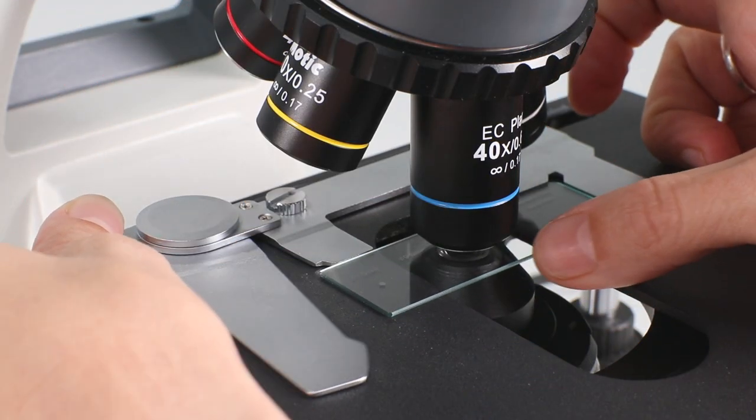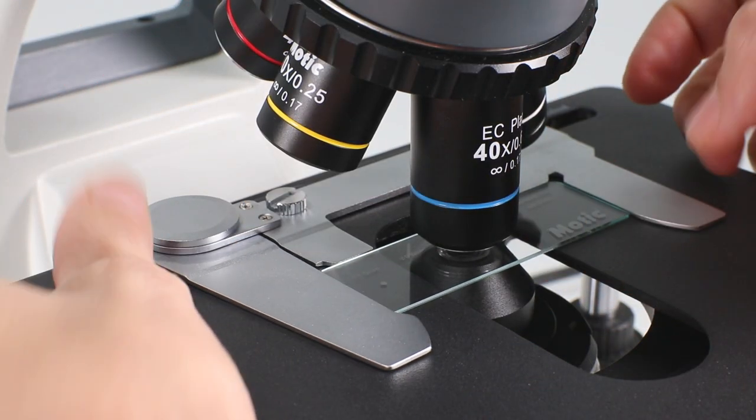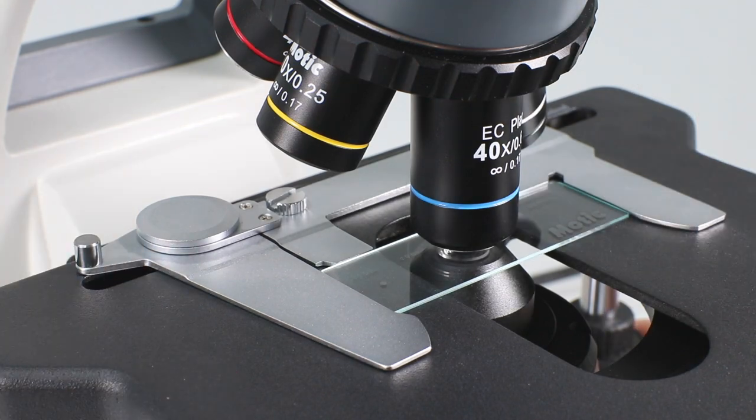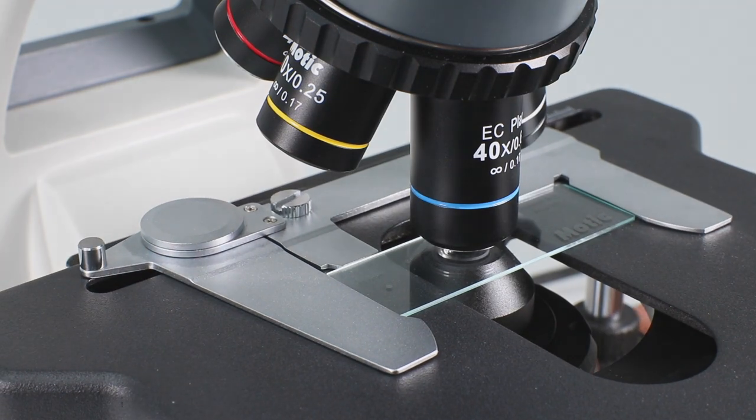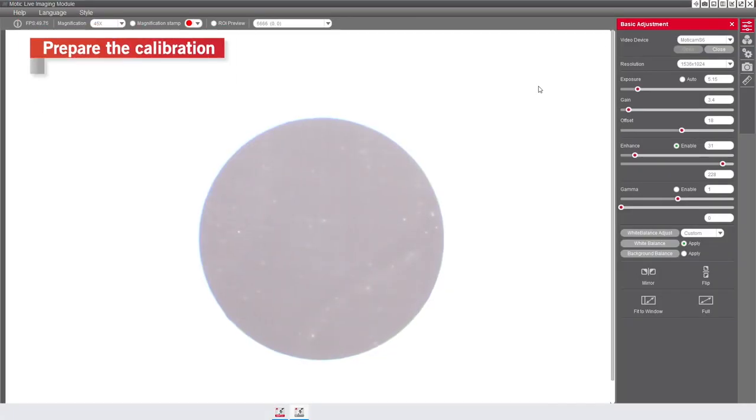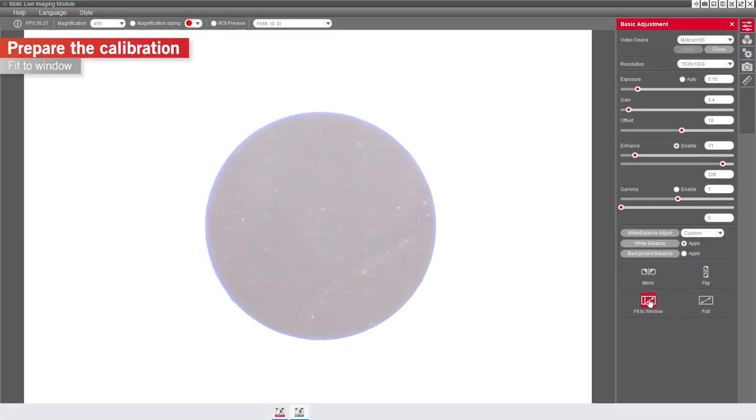First, place the calibration slide onto the microscope stage, and focus on the most suitable dot. Click on Feed to Window to visualize the complete field of view captured by the camera. The dot of the calibration slide should be completely visible within the image area.